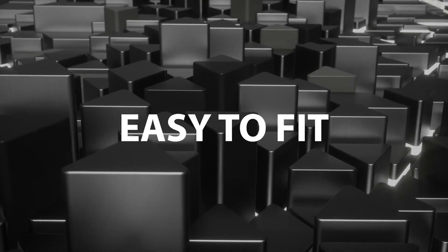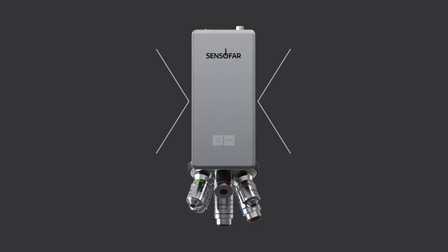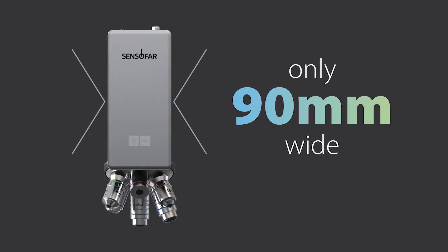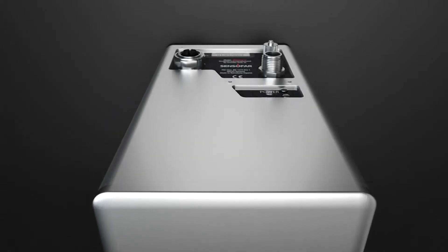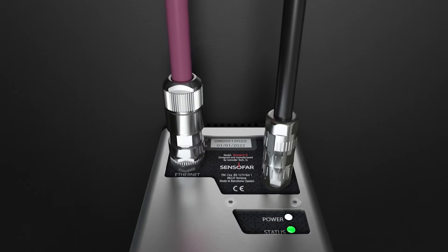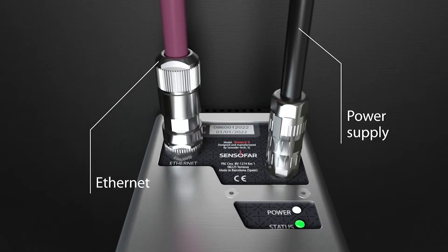The S-Smart 2, an easy integrable sensor head thanks to its reduced dimensions. Ready to go by plugging only two cables: one for the Ethernet connection and one for the power supply.